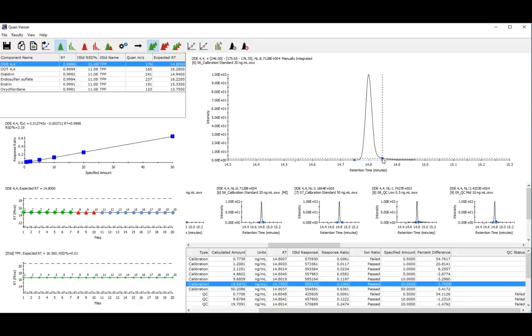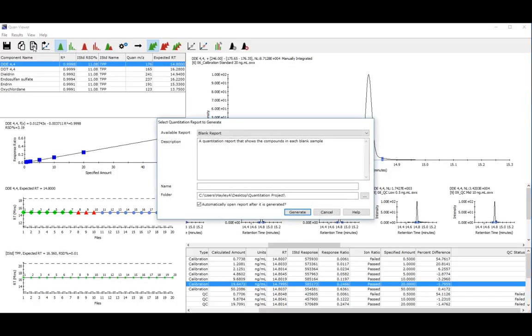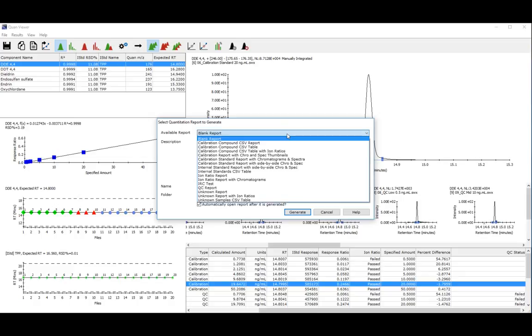Once you are happy with your results, you can then click Generate a Quantitation Report. There are a number of report formats available to choose from.